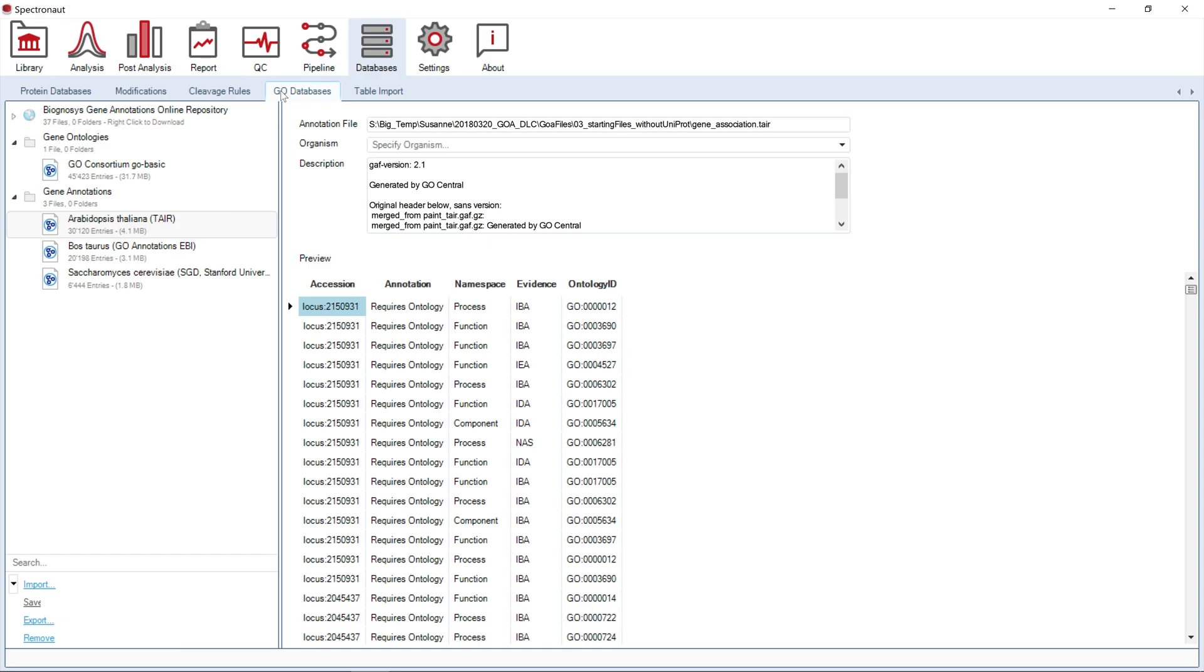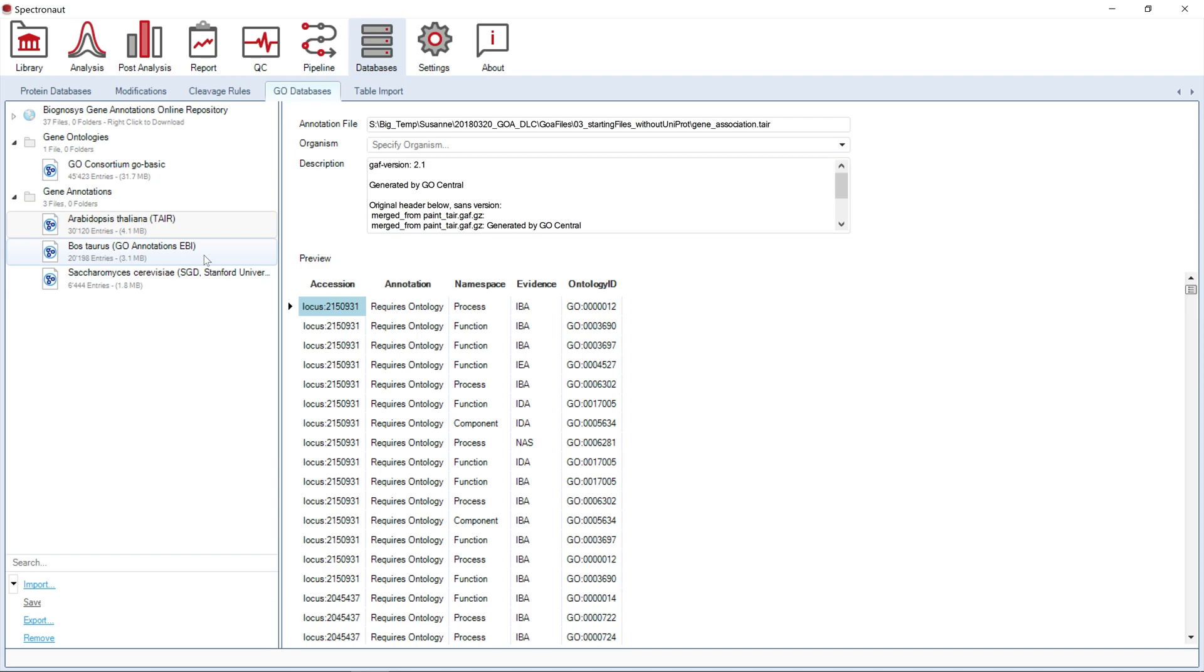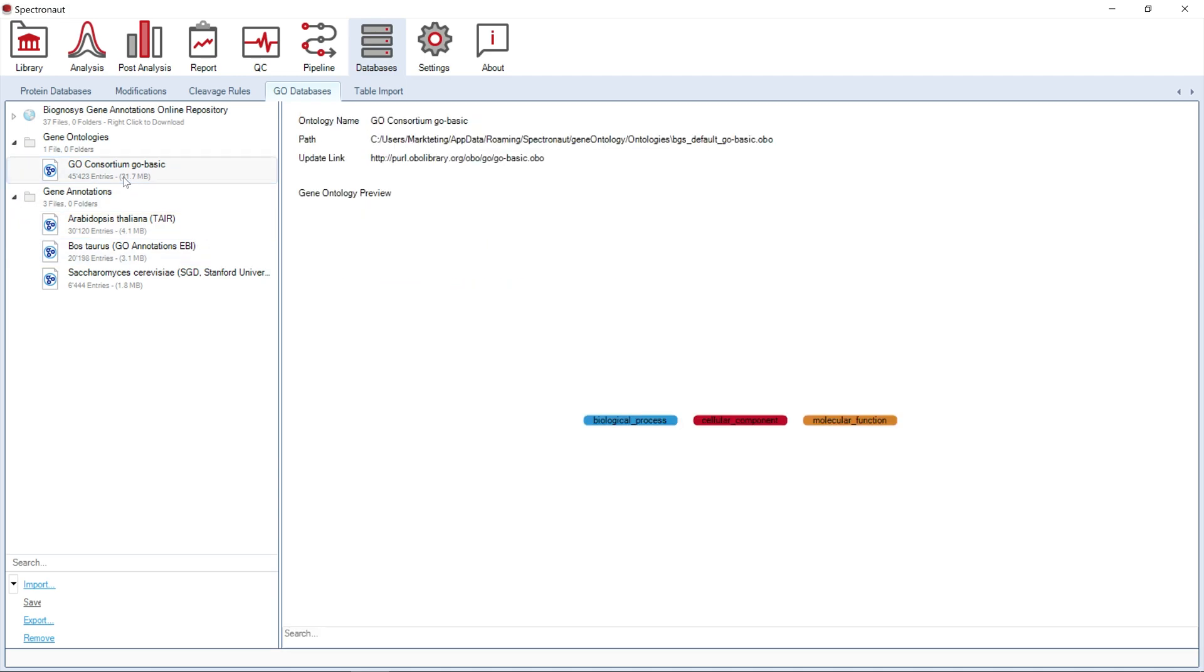The geo database section manages two different data structures: gene ontologies and gene annotations. Gene ontologies allow you to import complex gene ontology structures in the shape of graphs. These structures are used for hierarchical grouping of functions, components, and processes.